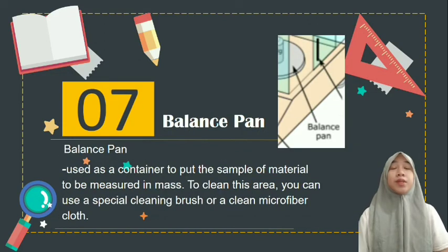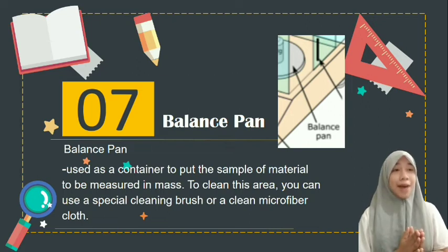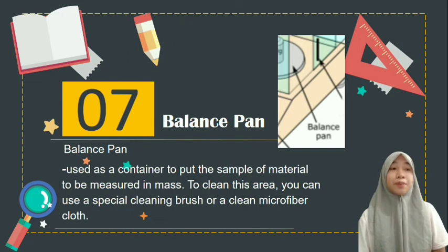Of course, the most important part is the balance pan. The balance pan is used as a container to put the sample of material to be measured. To clean this area, you can use a special cleaning brush or a clean microfiber cloth.